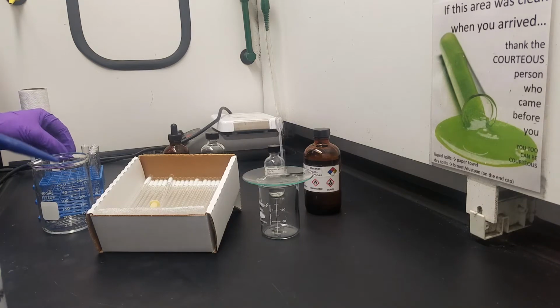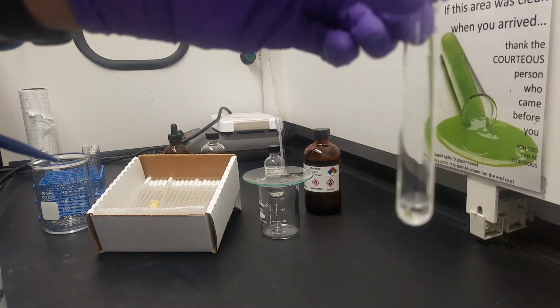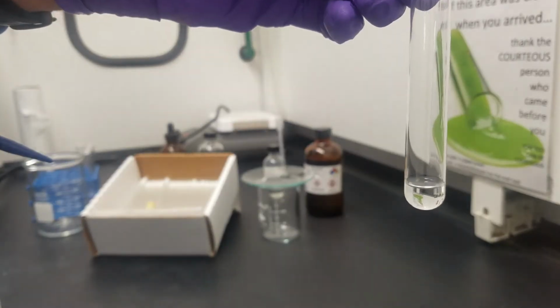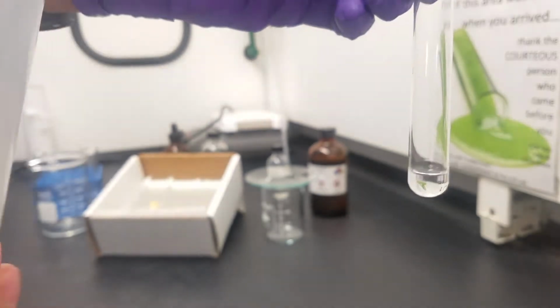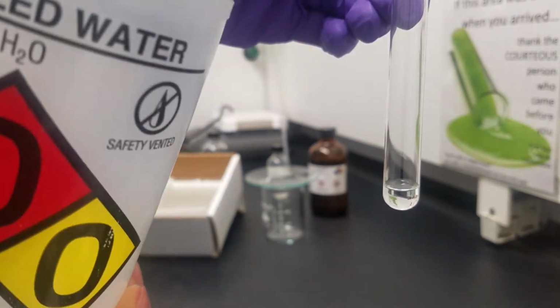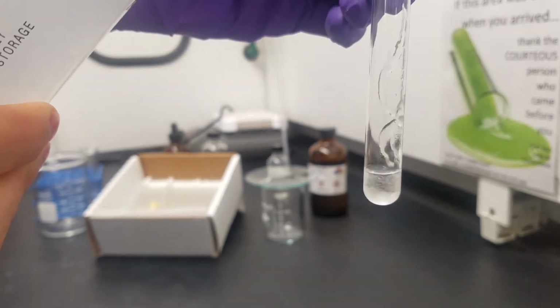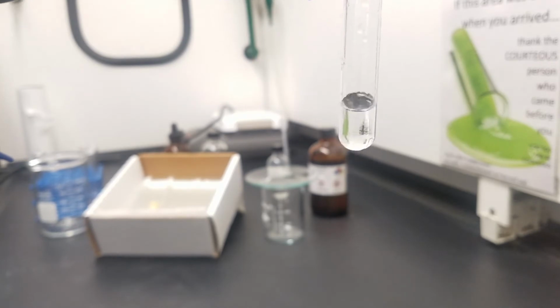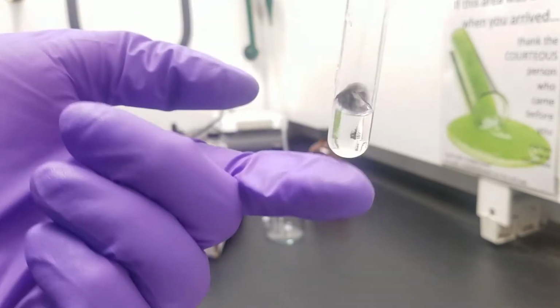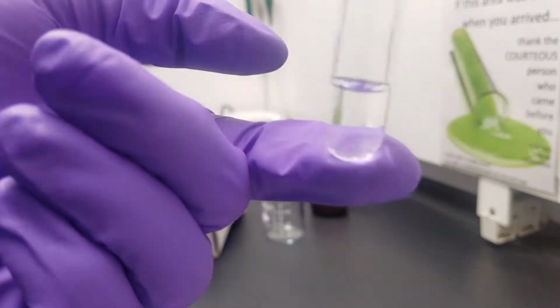I had some dexterity issues on the back end, so just to give you an idea, you'll see the test tube, hopefully a nice zoom in or refocus on the test tube with our first liquid on it, and then you'll see the second liquid added in over the top. Hopefully the sequencing of the words and the language all aligns, but it might not. But you want to make careful observations both initially and a little bit later, because perhaps your observation will change depending on what you see with other results.